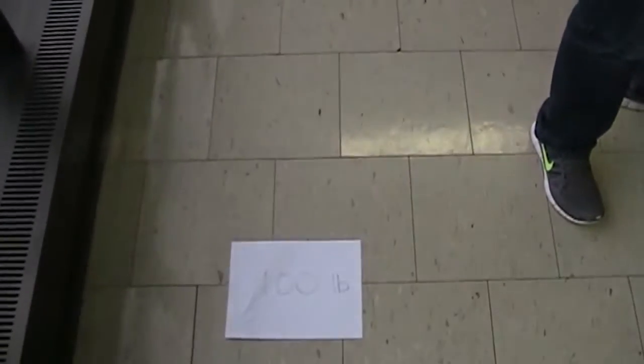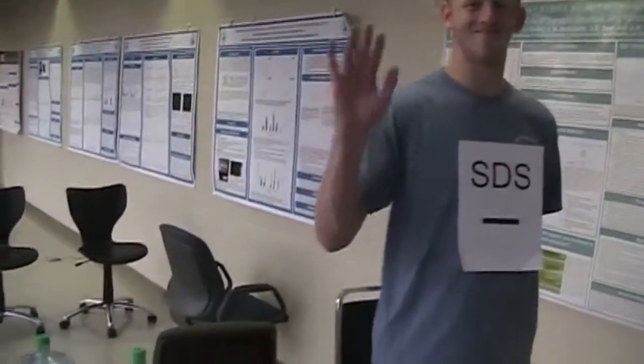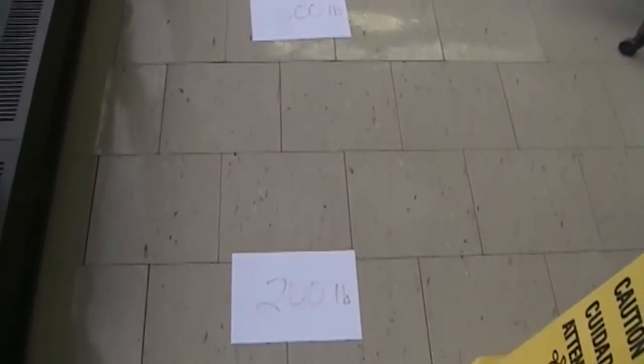As you can see, the smaller subunit can move farther now that the big subunit isn't holding him back. This separation based on size is extremely useful for identifying the molecular weight of a subunit and for purification. The molecular weight of our small subunit is just over 100 pounds. The molecular weight for our large subunit is right around 200 pounds.